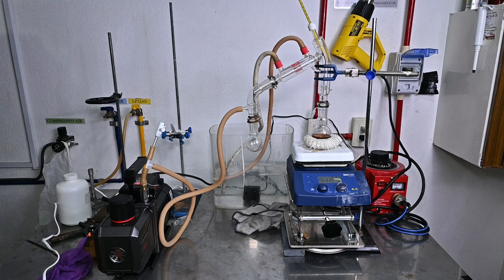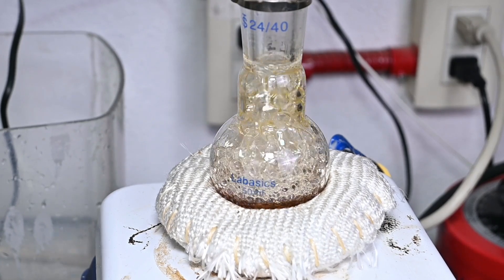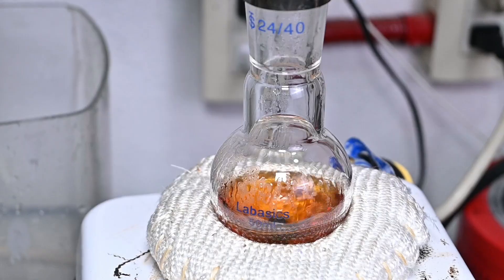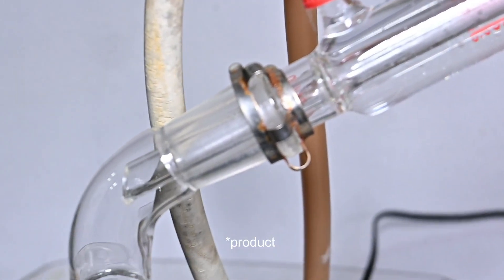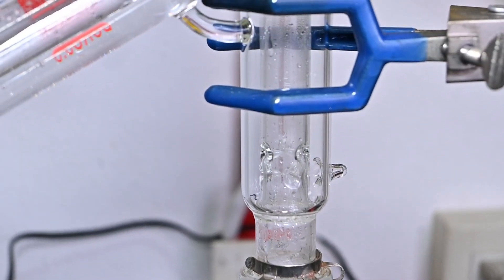This is how our final setup looks. We are using a short-path distillation apparatus in order to maximize the yield, and a vacuum pump capable of reaching almost 15 microns of mercury. After just a couple of minutes, we are finally collecting the first drops of our pure product. With the vacuum pump I am using, I am distilling my product at only 32 degrees Celsius.